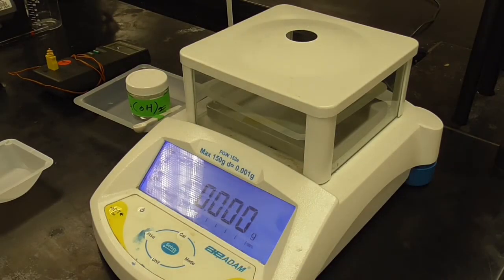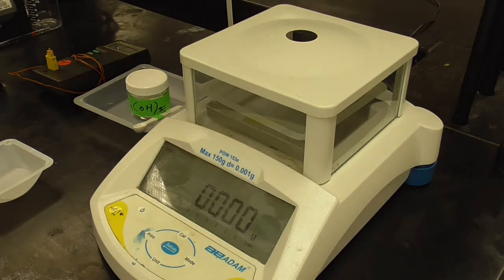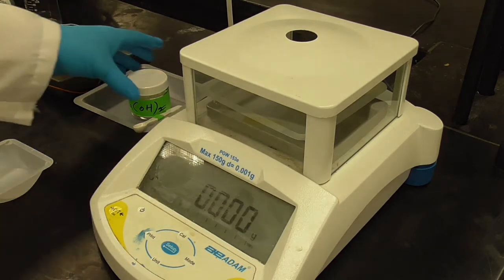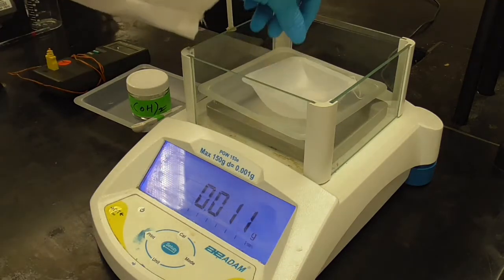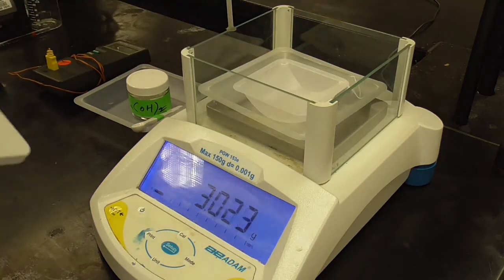Okay, so we're on to part B, the elevated temperature. We have measured out 150 mL of deionized water, and it says you have to boil it for 2 minutes. So we've been heating it and boiling it, and so that's already kind of going. So we're going to add approximately 2 grams of solid calcium hydroxide, and so I have to weigh that out. So I've zeroed out the balance. Put my weigh boat on there.